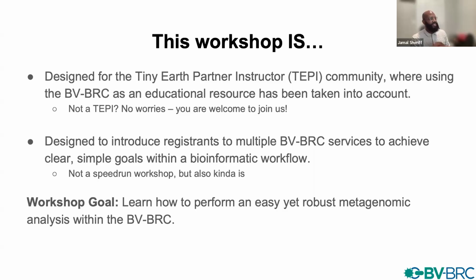We're using the BV-BRC as an educational resource, meaning if you're teaching a Tiny Earth course, the analyses you might be interested in are something that maybe a small set of students, or a larger class of 20 to 30 students, will be performing. So you might want to learn how to do particular things that are important for the bioinformatic workflow, but you might not need to know about every single thing that you can do within the BV-BRC. That's what it's designed for.